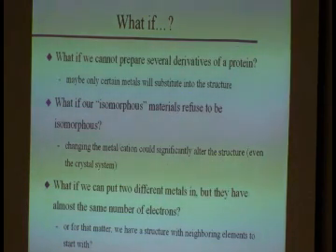You could alter just the structure. In some cases you'll even go to a completely different crystal system, okay? In that case you know something is wrong. It's not isomorphous. Or maybe you can put 2 different metals in, but the 2 different metals aren't all that different. They have very similar numbers of electrons. All of these would be reasons why your beautiful isomorphous replacement, as demonstrated on the last couple of slides, would not work too well, right? So what do? Give up?